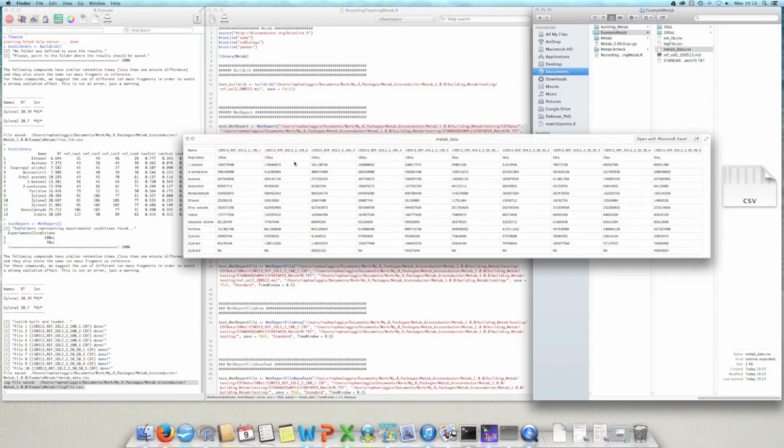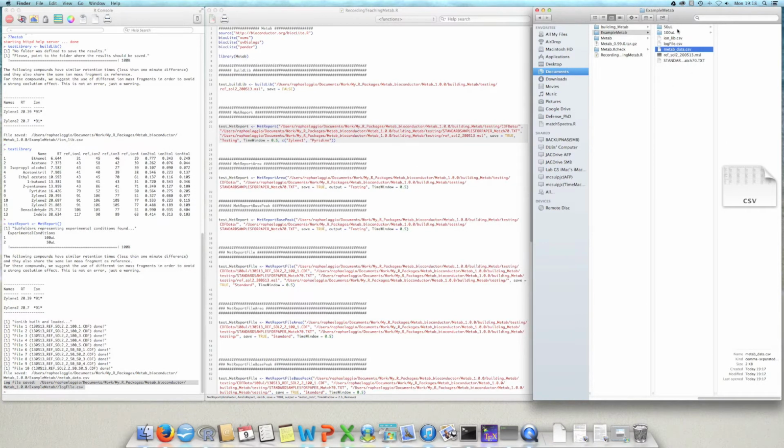And in the first row you have the name of the experimental condition related to each sample. It does that automatically because you divided the samples into different folders. So what the package does is identify the folders and know that those files were coming from this folder.